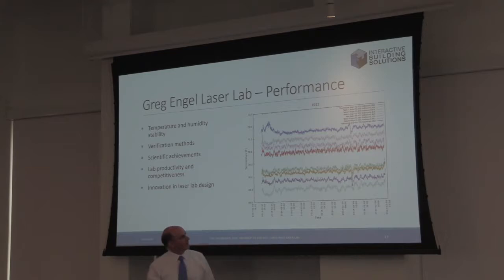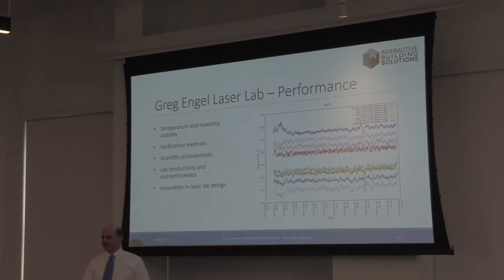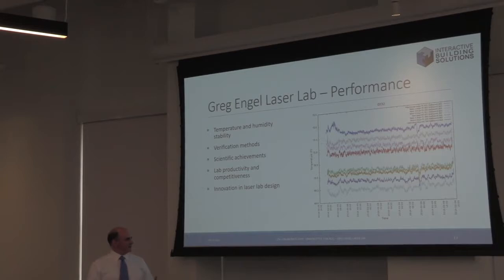I monitor at 16 points around the room every 30 seconds all the time. So when something starts to get really out of whack, we can always pull it up. For about 9 years, I had that live on my website. Anytime anyone in the country wanted to click on it and just see what's happening in the lab today, you could do that. Recently, Perl updated my SQL engine, so I have to recode. So for the last year or two, I haven't gotten to it because I've been doing other things. But this thing just sits there.